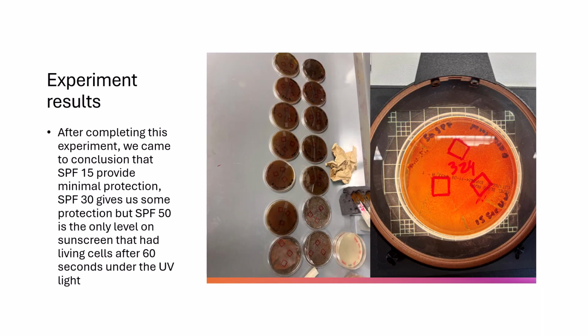So at the end of this experiment, we came to the conclusion that SPF 15 does provide minimal protection, but not very much at all. I would not recommend it for long exposures to UV radiation. SPF 30 also gives us some protection, but still I would not recommend it for a long time of exposure to UV radiation. And then SPF 50 is just about the only level of sunscreen that had living cells after 60 seconds under the UV light.